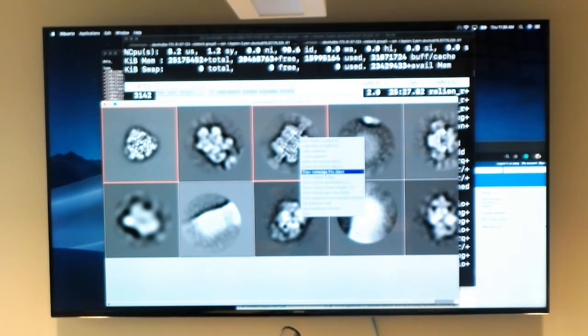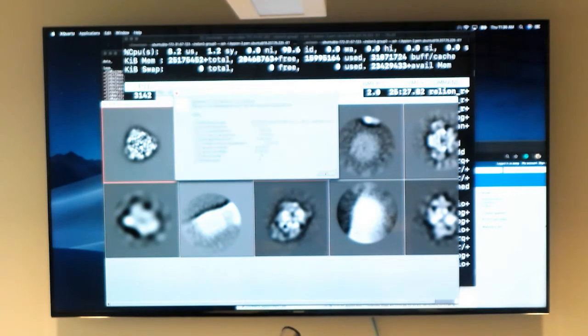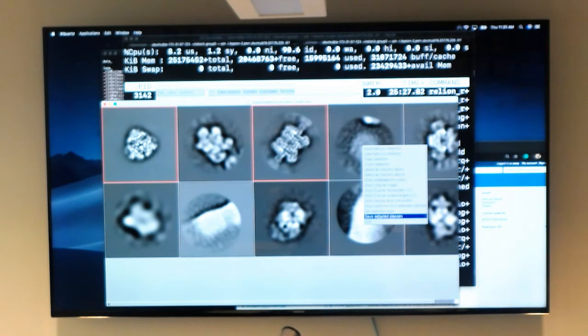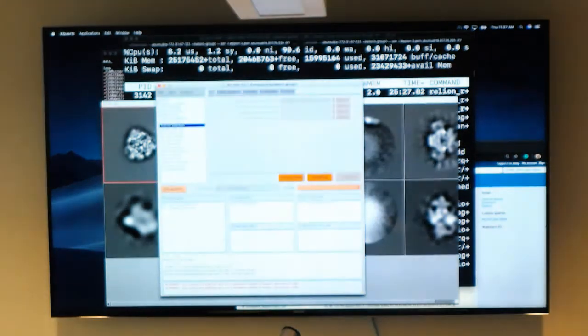do your second mouse click, you can show data. For example, I selected 21,000 particles of that. You can see, or you can just select each particular class and get some statistics. And then you can save selected classes. If you just go into the display, this is grayed out. So if you did classification and you want to save those classes, you have to explicitly go into this subset selection job, pick a particular star file and run it.